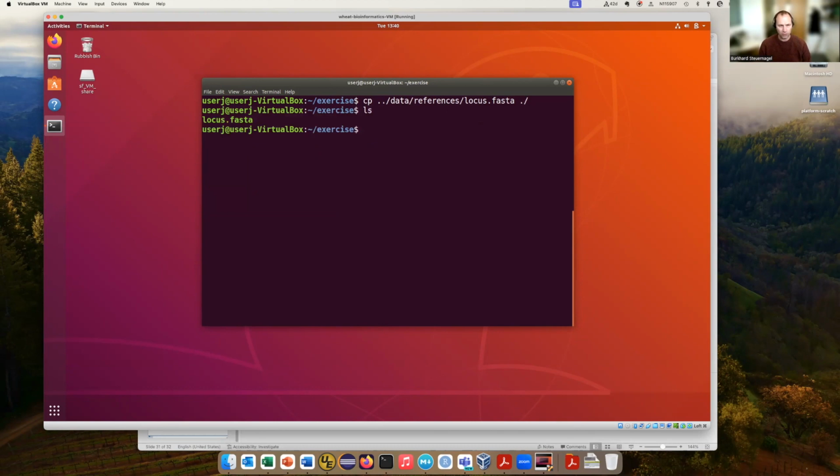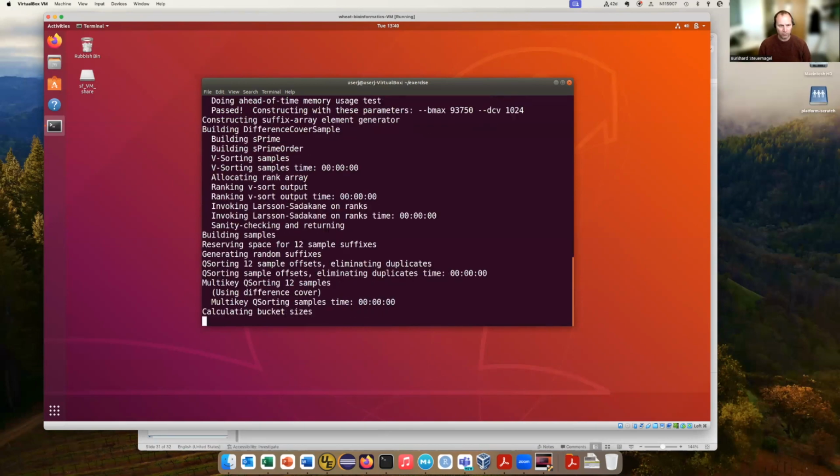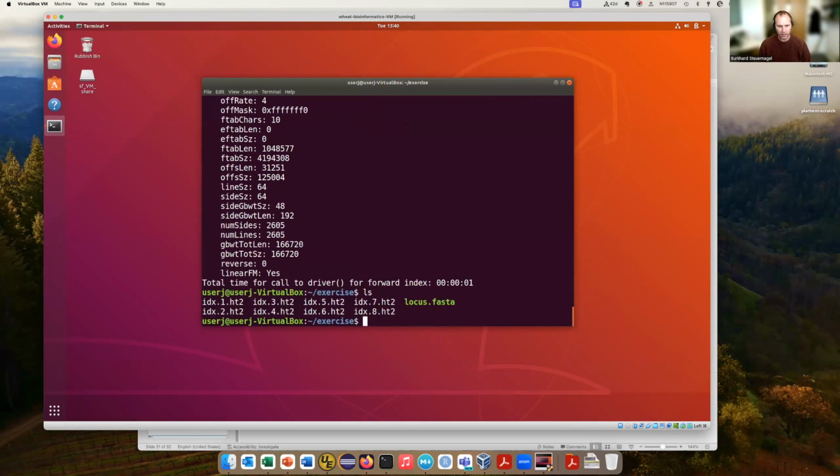So of course we're using HISAT2, and we need to create this HISAT2 index again, although we probably have done that just now. hisat2-build index. You probably have all this right now. So we've created the index files, and now we need to copy our avoset raw data into this folder. I have it in my raw data folder.